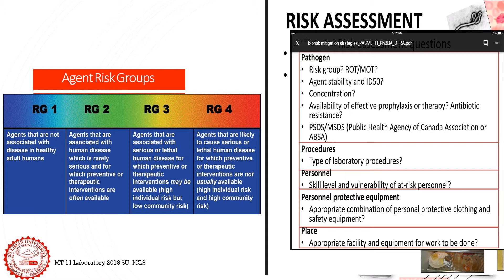Our infectious pathogens are classified into agent risk groups. RG1 are agents that do not cause disease to healthy adult humans. RG2 are agents that may cause disease to humans but not serious and can be prevented by therapeutic interventions. RG3 are agents that can cause serious or lethal disease to humans with available therapeutic intervention. RG4 are agents likely to cause serious or lethal human disease for which therapeutic interventions are not available most of the time.